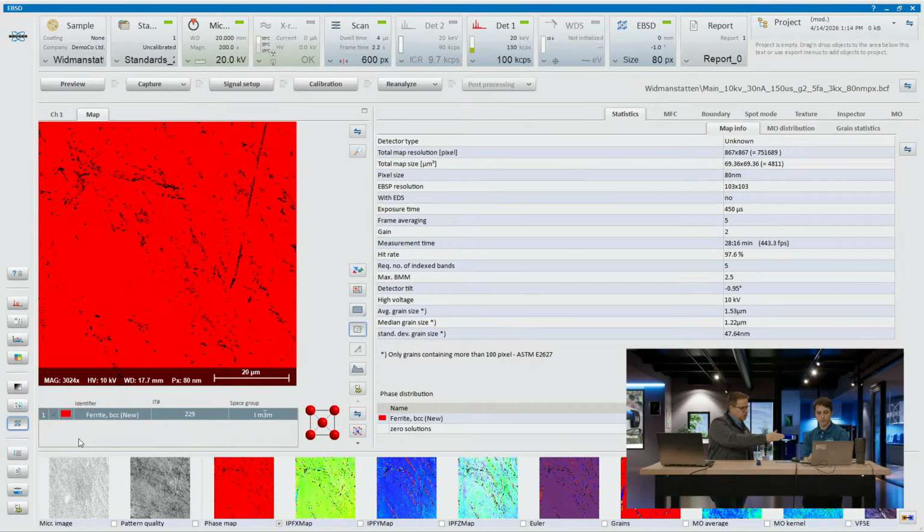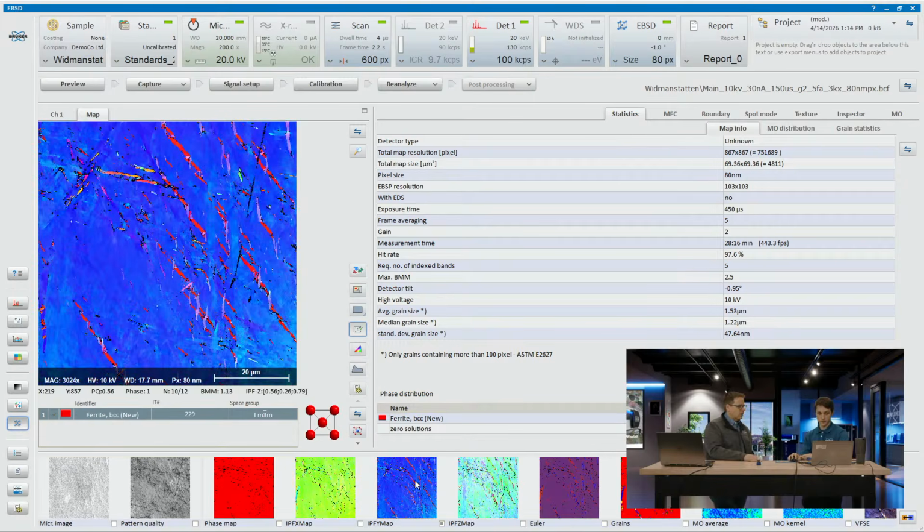So a lot of nice information, and you can see there is so much more you could dig into here. We do only have so much time.